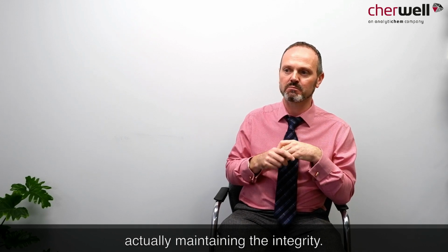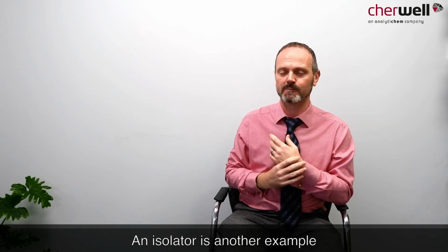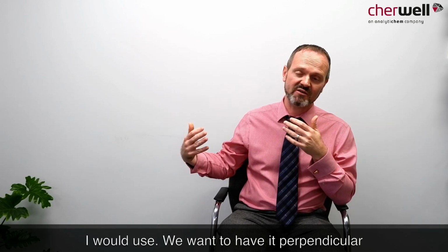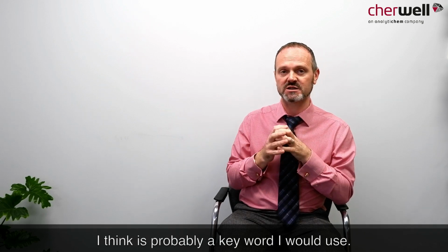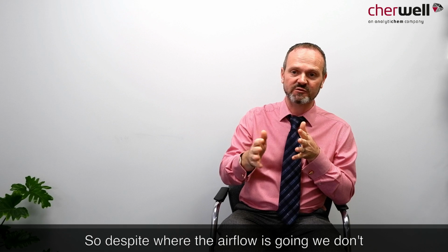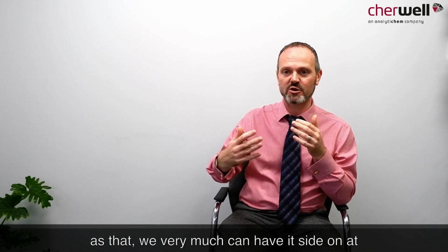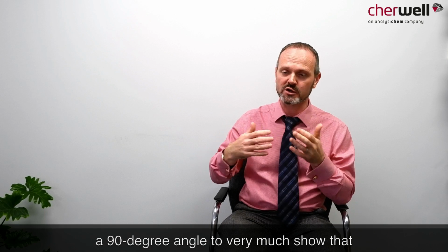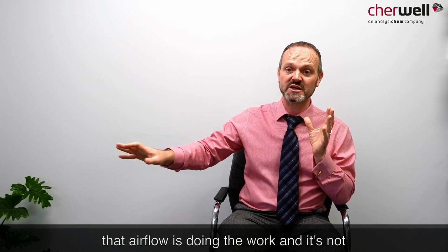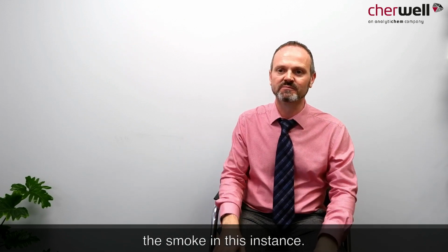Showing that we're maintaining the integrity of an isolator is another example I would use. We want to have it perpendicular, which I think is probably a key word. Despite where the airflow is going, we don't have the smoke going in the same direction as that. We can have it side on at a 90-degree angle to show that the airflow is doing the work and it's not the smoke in this instance.